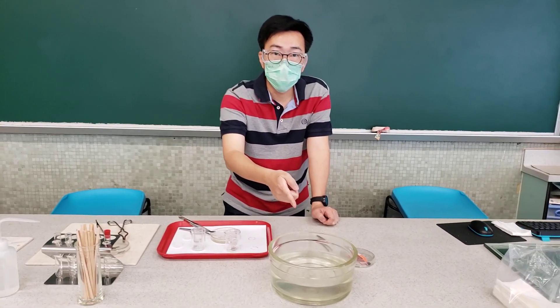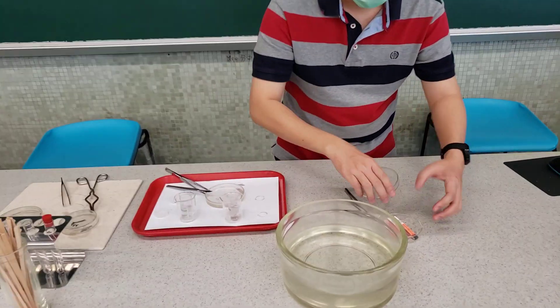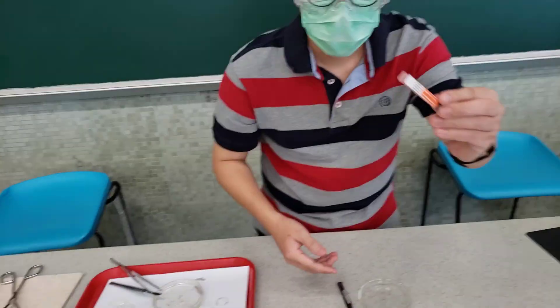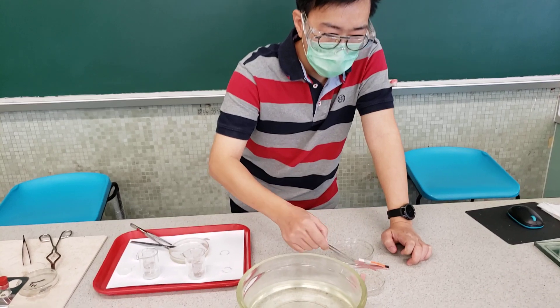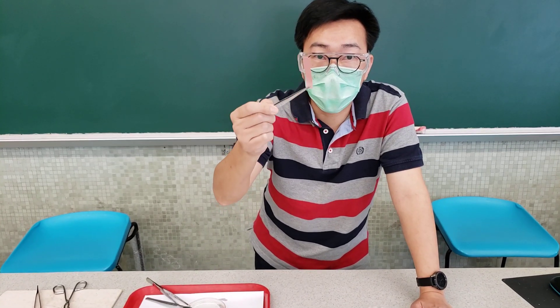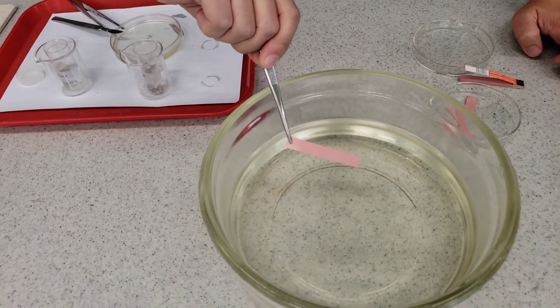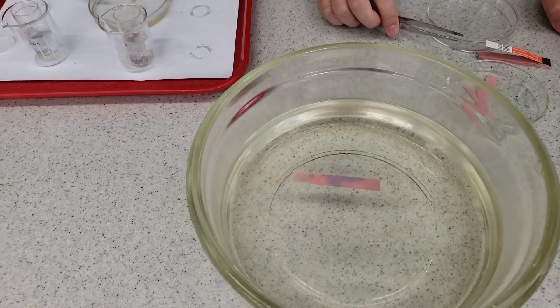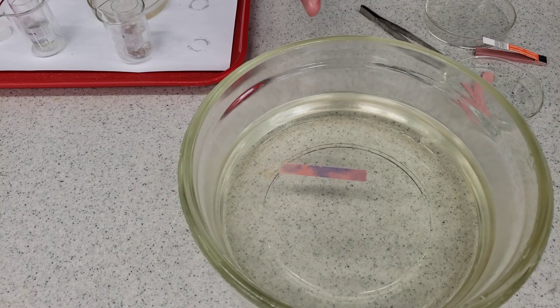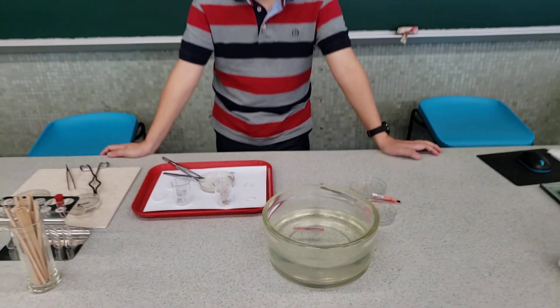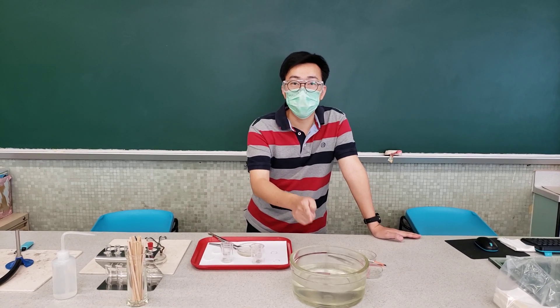What do you think of the water? Will there be any change about the water? Let me show you. This is red litmus paper. It is used to test for the acidity or the alkalinity of a solution. Let's see how a piece of red litmus paper will change. What did you observe? The red litmus paper turns blue, indicating that the water becomes alkaline.